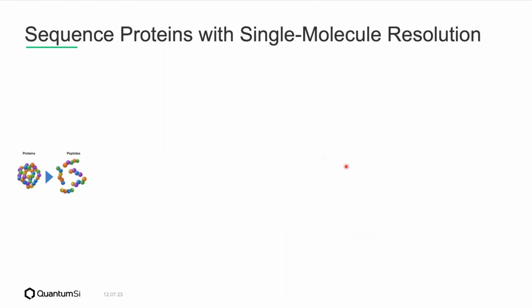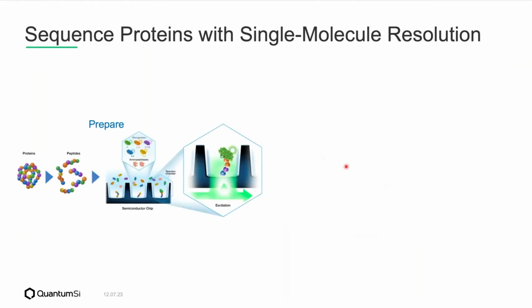Once these peptides are loaded onto the chip, we add a sequencing solution to the chip that contains our fluorescently labeled N-terminal amino acid recognizers, as well as our aminopeptidases. The N-terminal amino acid recognizers will bind to and associate with specific amino acids through a series of on-off binding events, generating a fluorescent signal that is captured and collected by the chip. This fluorescent signal contains information such as the fluorescence lifetime and intensity information, and is what enables the discrimination of the recognizers on the chip.